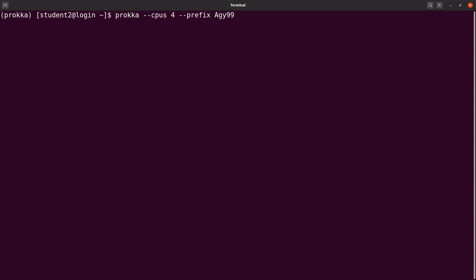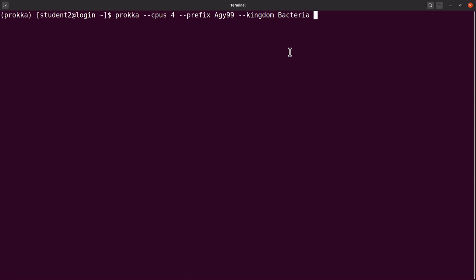Let's also specify kingdom. Let's say bacteria. So Prokka annotates other organisms apart from bacteria and it also uses their respective genetic codes. So specifying that kingdom allows Prokka to use the appropriate genetic code for the annotation. So this time it's bacteria, and so Prokka will know that it has to use the genetic code for bacteria.